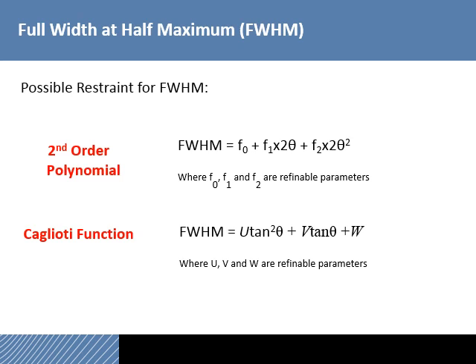And you will see that the peaks broaden out substantially once you get past 80 or 90 degrees 2 theta. If you're doing a lot of work in the high 2 theta region, and you're running your plots out that far, that's where the Caglioti function puts more emphasis on the high 2 theta region.